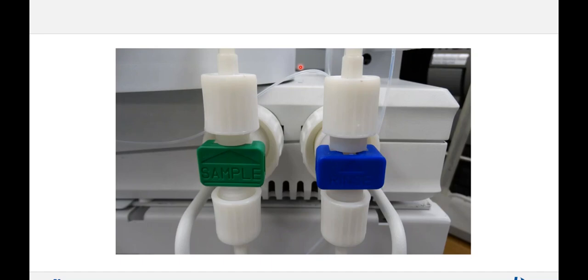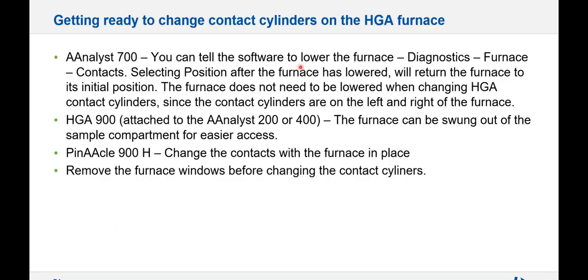Now, the sample pump does not have check valves, so you want to make sure that you don't put check valves in the sample pump. It has inserts. All right, so getting ready to change your contact cylinders.